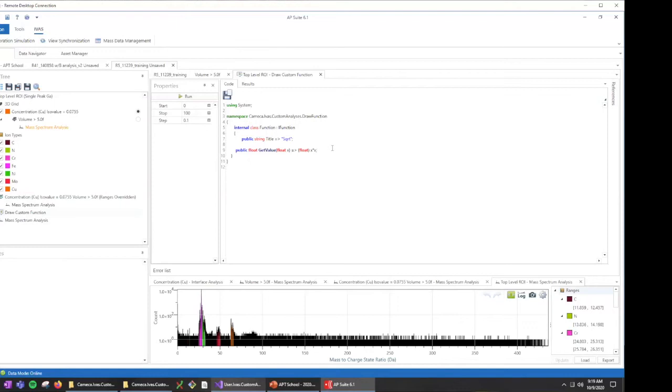Whereas if you have separate documentation, on the web somewhere or in a doc file, it's not self-checking and self-fixing like compiled code actually is. So my personal belief is that the documentation should be examples. That's what I plan to do: publish in a Git repository examples for every type of API call that we have, and then give you some ideas of what sort of things you can actually do, as opposed to just blindly documenting it.